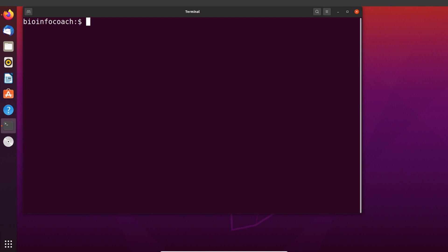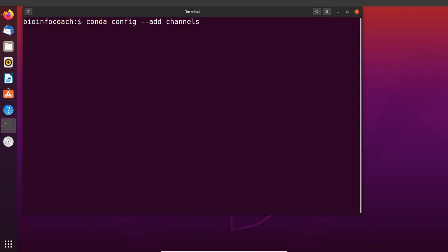We are going to add bioconda, so we say conda config --add channels and we are going to specify the name of the channel, in this case bioconda. So let's run this command. Okay, the channel has been added.